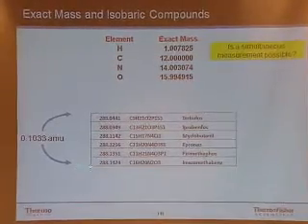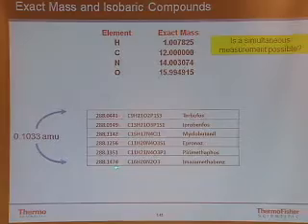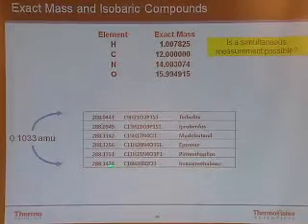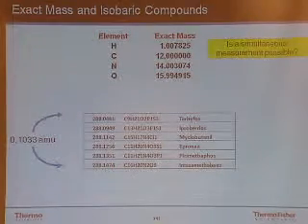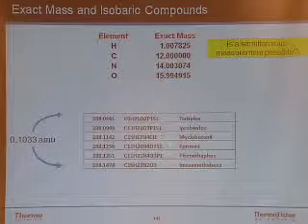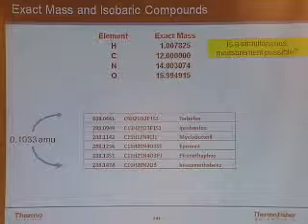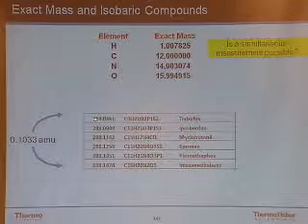And you notice that here you've got the molecular weight out to 4 decimal places. So like this one is 1474. That means that last 4 is accurate to 0.1 millimass units. 0.1 millimass. Okay. So let's assume that we've got all 6 pesticides. Now, how did I calculate these exact masses up here?